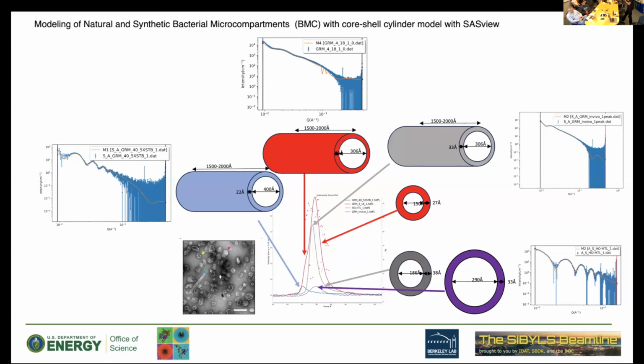By adjusting this model, we can fit the data and validate it. It's just validation, not a new prediction. Based on the PAE matrix, the confidence in the fold and the confidence in distances between the regions are what we're using to fit the data better. Josh is going to talk about it.